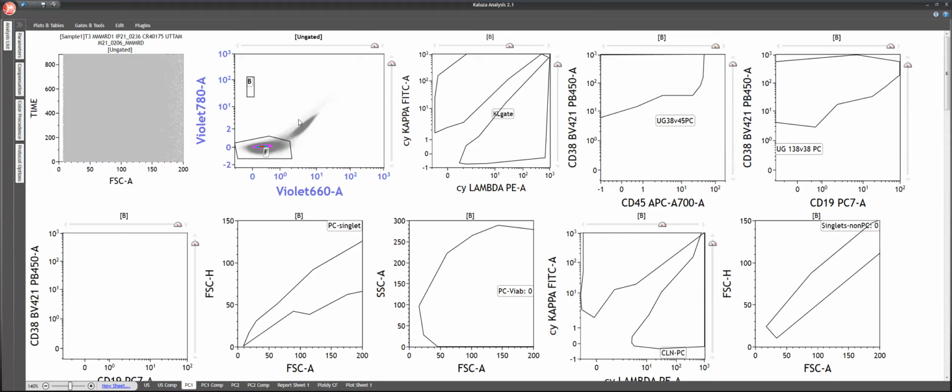So to avoid false negativity, if you see using these parameters that the marrow is hemodilute, then we generally give a comment saying that the marrow is hemodilute and low level MRD cannot be detected. But if you see abnormal plasma cells and MRD is positive, then you can report the MRD, but you still give that comment if hemodilution is there, because your MRD level may not be representative.